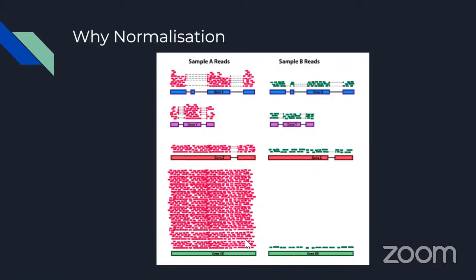So when you divide by the total number of reads, which includes these very high counts, it would lead to a very small number of read counts in other genes. We should also take this into account. This is called RNA composition, where we have to discard the information of gene DE when we want to normalize.